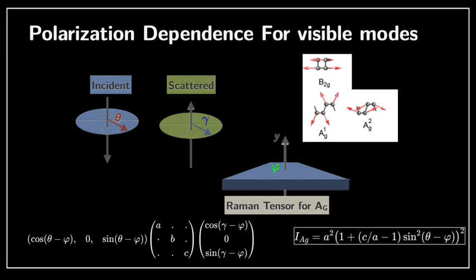So this is actually very interesting because when you do this calculation as polarized Raman spectroscopy, which means that you replace theta versus phi, and here we put gamma equal to 0, we use gamma equal theta, sorry, you can actually obtain a plot as a function of alpha, and the particular shape will obey a specific function of the angle, as the one I show here. And if you can do that experimentally, this is an additional demonstration that you have identified the right mode.